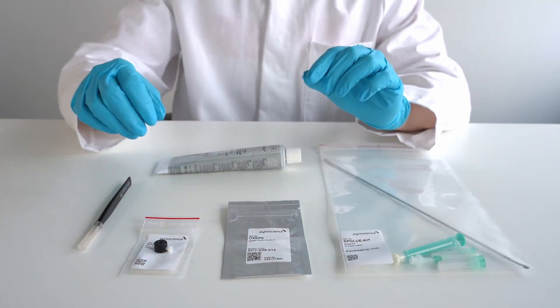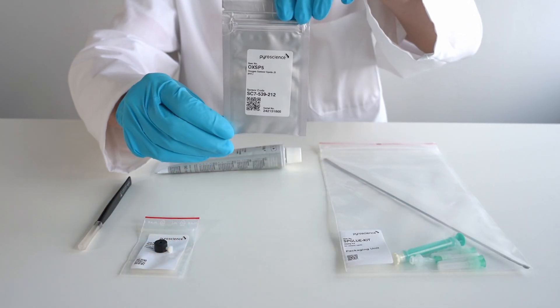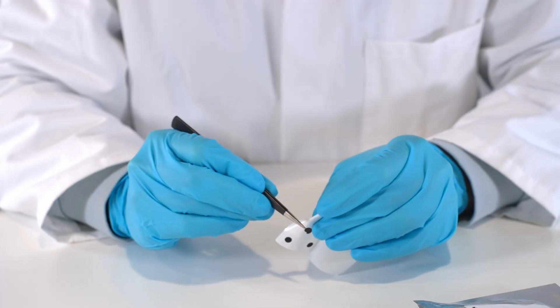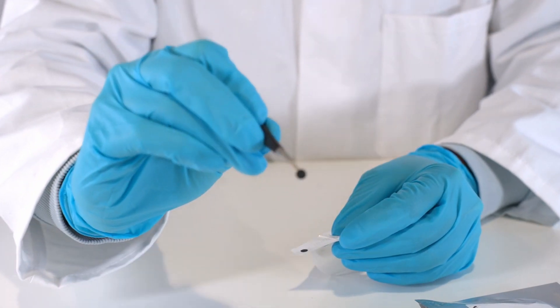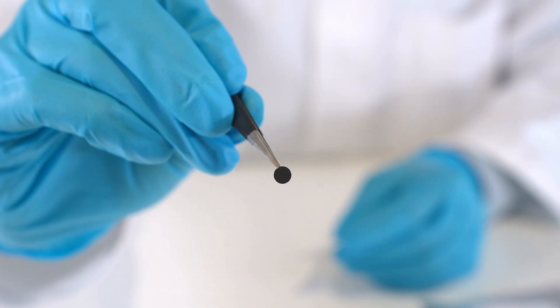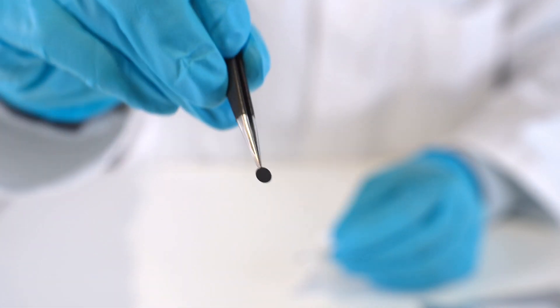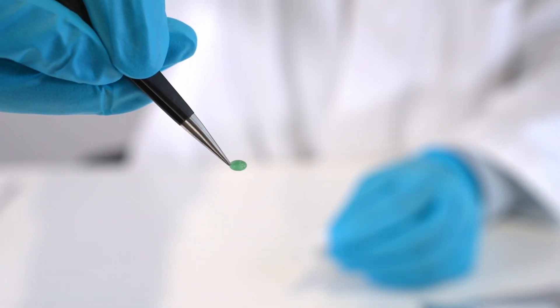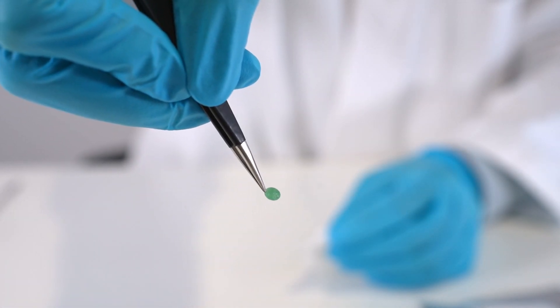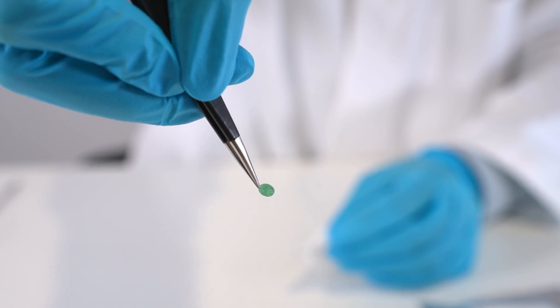In our example we are using the oxygen sensor spot oxsp5. The sensor spots have an optical isolation on the sensing surface which has to be placed in direct contact with the gas or aqueous sample. The backside of the sensor spots is green with a smooth surface which has to be glued onto the inner wall of the sample container.